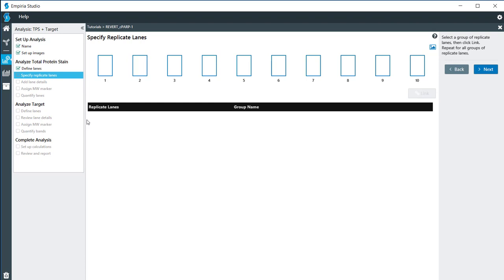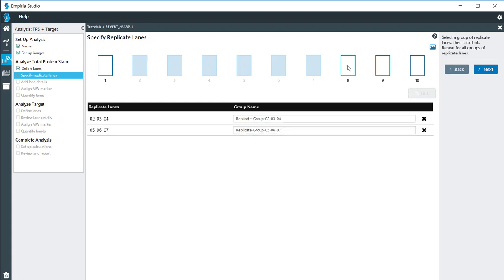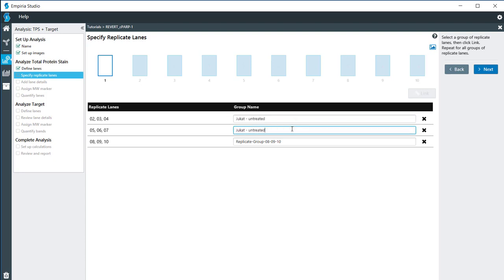I do have replicates on here. In lanes 2, 3, and 4, I have one replicate treatment. 5, 6, and 7, I have that as well, and also in 8, 9, and 10. In my first set of replicates here, these are Jurkat cells and these are untreated. I'm going to copy that down to here, and in this one, these were treated with etoposide. I'm going to copy that information down to the next line here.